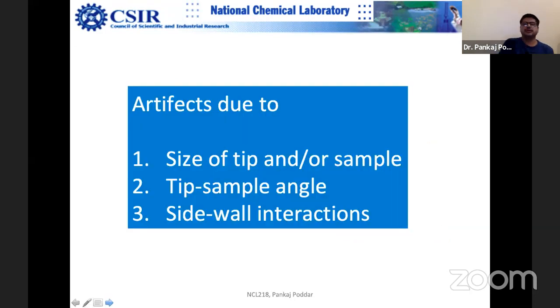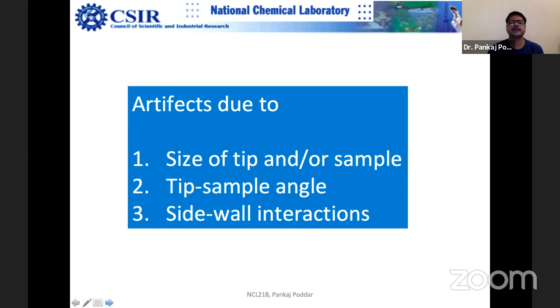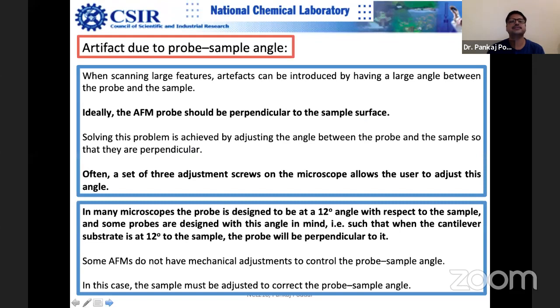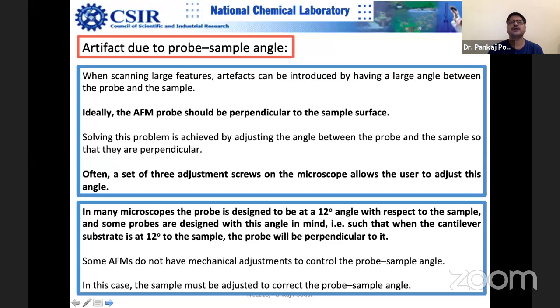Artifacts due to probes can be subdivided into: size of the tip and sample, tip-sample angle, and sidewall interaction. If you have a pit with 90-degree sidewalls, it is not easy to confirm that you have reached the bottom, because the sidewall of the tip and the sidewall of the pit both interact, creating a convoluted image of that pit.